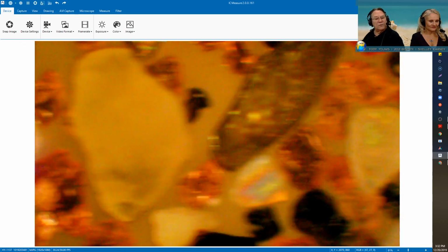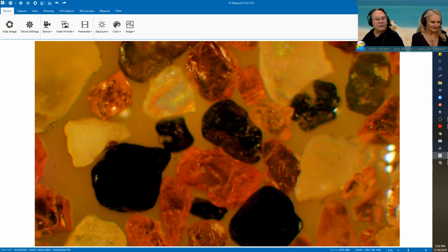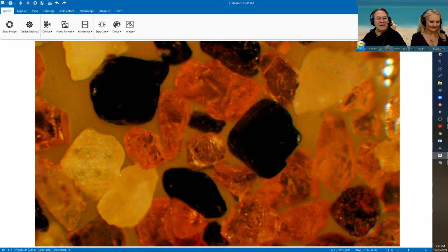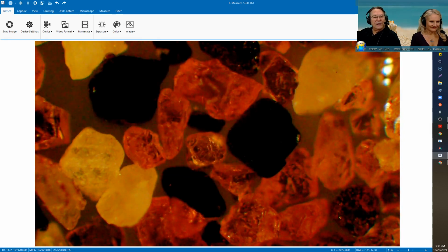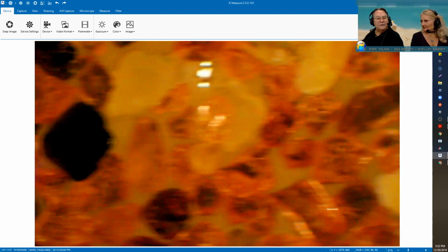I'm just going to scroll across this to see if there's anything really interesting. You'll see some of this black stuff that I thought was obsidian right there. It just has such a dark, kind of absorb-the-light look to it. I've got to believe it's obsidian, which has that shiny, glassy look on it. And if I play with a polarizer on it, I don't get anything out of it, right? It goes straight to gray, and that's the result of the polarizer not knowing what to do with it. So I've got to believe the pure black stuff is obsidian as opposed to magnetite.